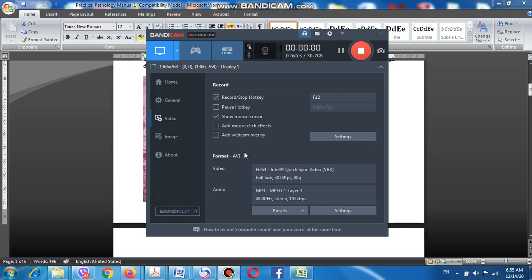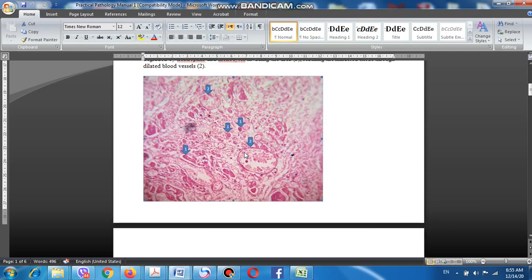These necrotic cells have lost their nuclei, they are deeply eosinophilic, and they have lost their cytoarchitectural features. All these are evidences of myocardial infarction.